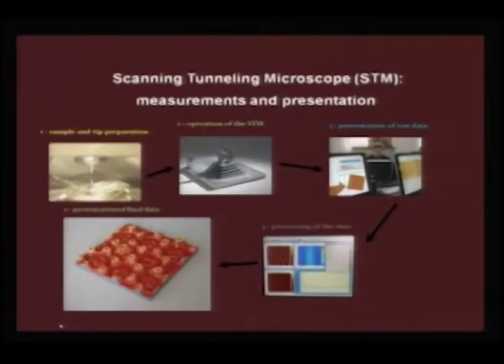In the scanning tunneling microscope, the protocol, as I told you, the first one is to do with the sample preparation, then tip preparation. This is a real time photograph taken in an ultra high vacuum environment, where you can see the tip actually approaching the surface of the sample, and you can see the tip seeing the mirror image of its own as you bring it closer to the surface.